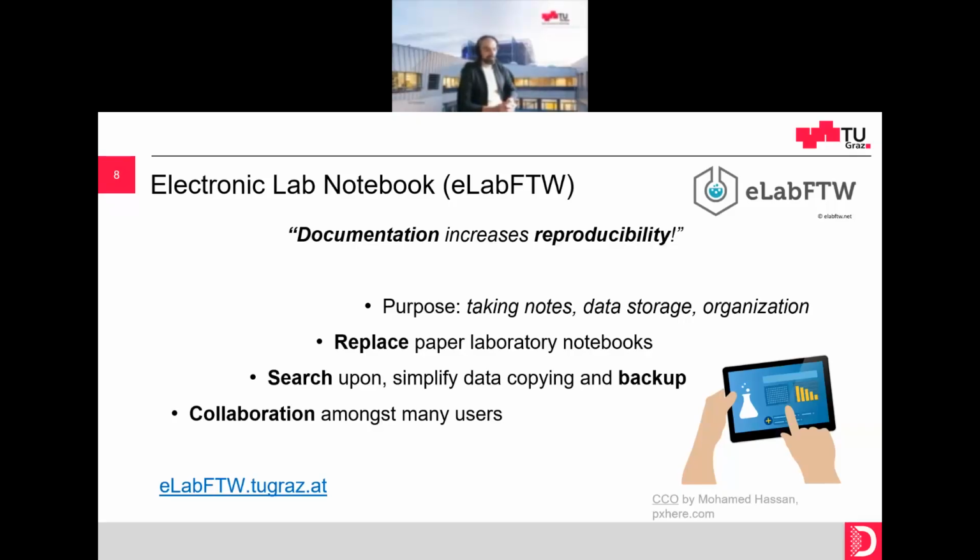And it gives you the ability to search across the different entries that you have in your ELN, to simplify the grouping of different kinds of data and entries, and also to have a backup automatically in the background, so you don't have to worry that your data, or metadata, especially metadata here, is safe. And the last point I really want to highlight is that it's also intended for collaboration.